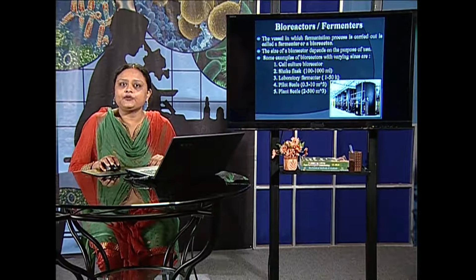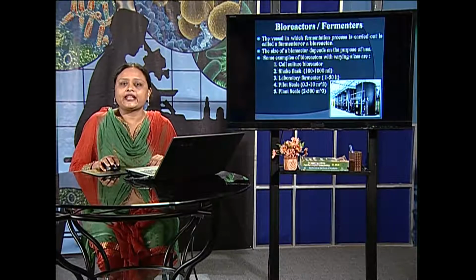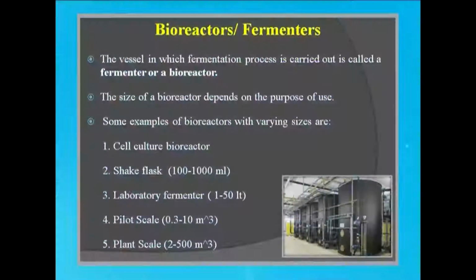The vessel in which microorganisms are cultured and we get a product for the mass scale starting from a substrate by incorporation of microorganisms or some biological agent is known as fermentation technology, and the vessel where they are cultured is known as the bioreactor or fermenter.